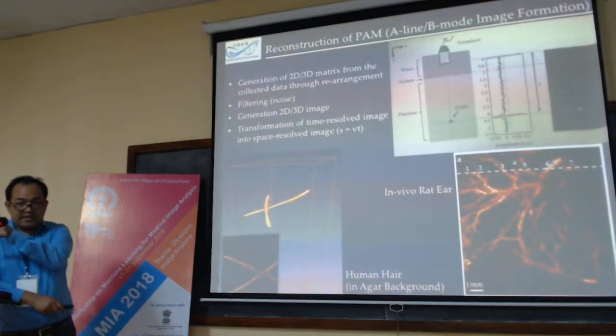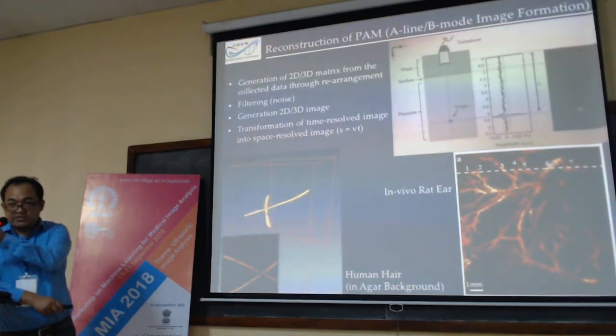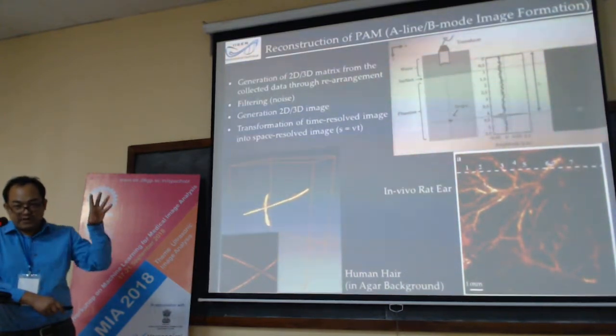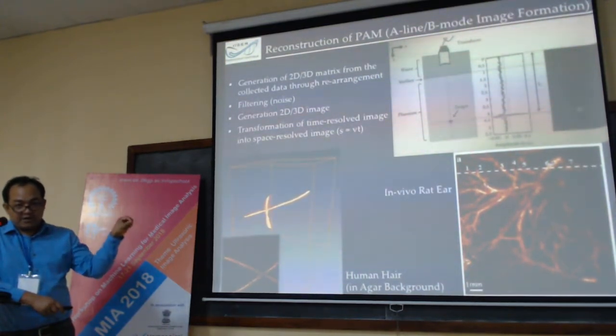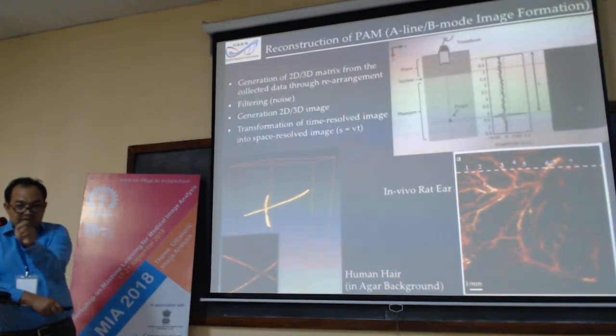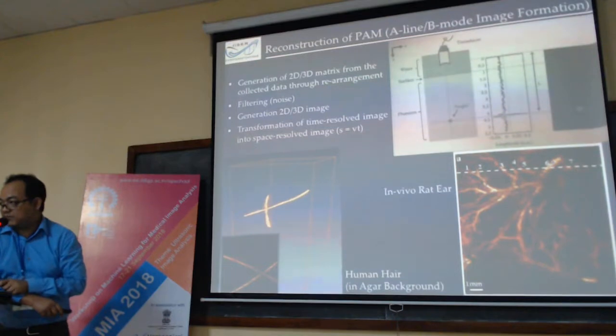The people who are working in the tomography regions know the penetration depth is of the order of centimeters. They want to increase the resolution, touching the microscopy. In these microscopy regions, they know the resolution is very high, but the penetration depth is small. They want to increase the imaging depth. That is how people are moving.